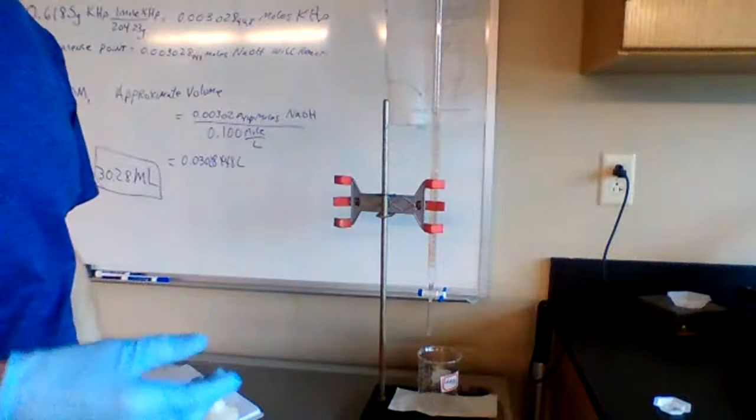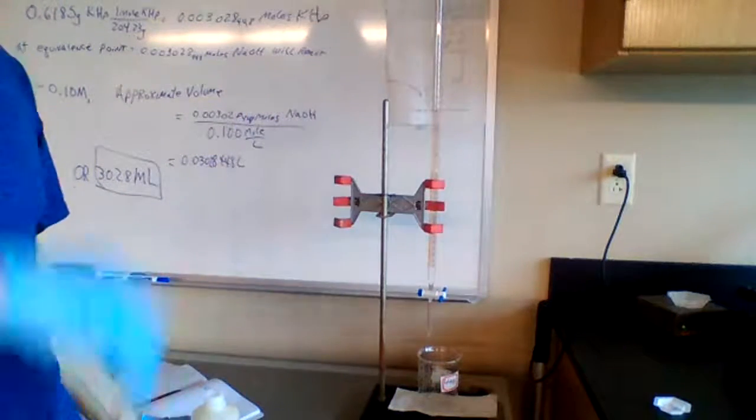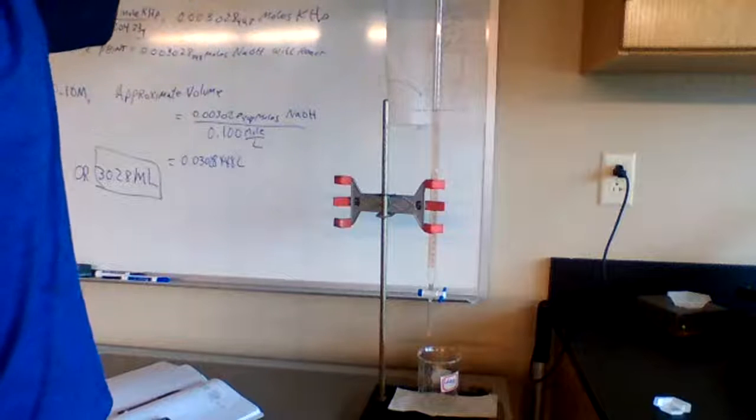Now the lights went out, so maybe we could see it a little bit better. Sorry about that.